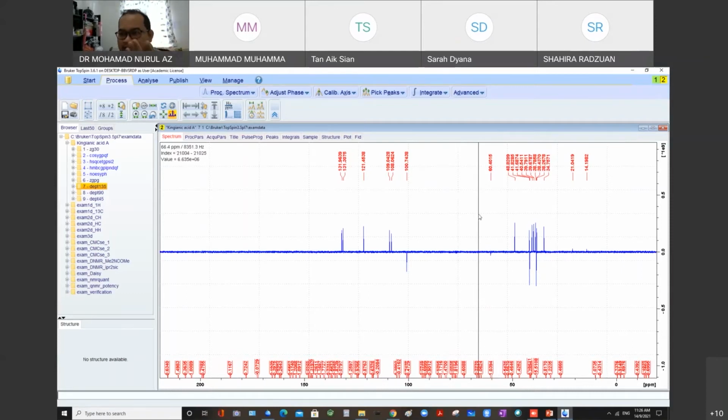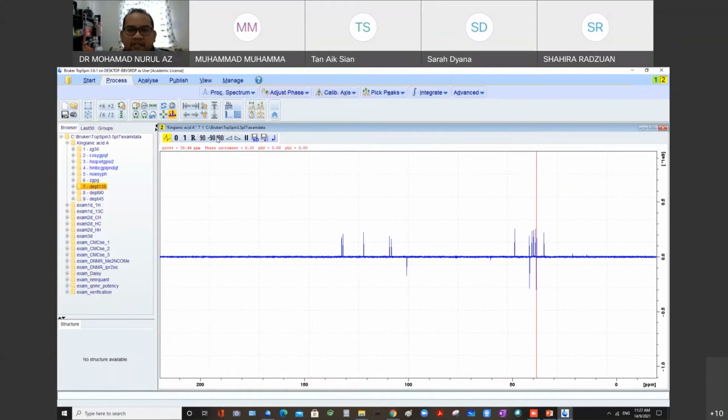For example, it happens when you have triterpene compounds. Normally it's mixed up. You say, this is terrible, I don't accept it. Why are CH and CH3 measured in negative mode, not the positive mode? It's okay. Go to adjust phase, just change. Done. And you can change back.